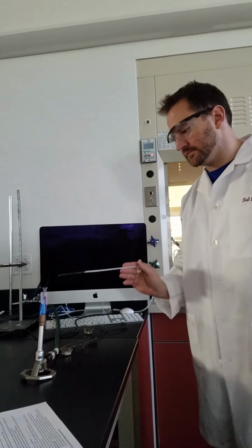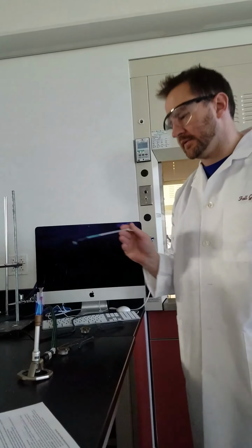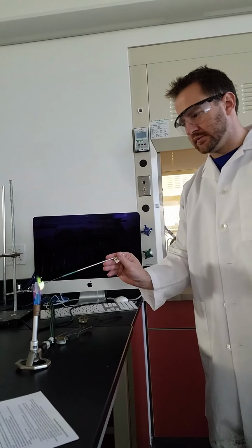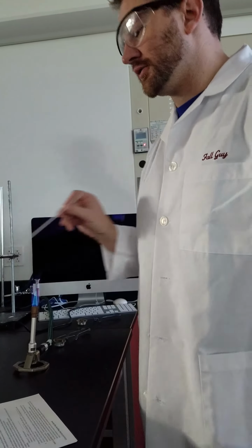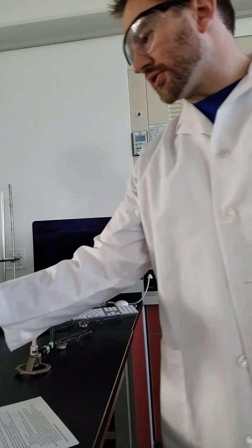Potassium. Copper. It's a nice green flame. And now, based off what you've already observed, I'd like you to identify what this unknown would be, just based off of color.